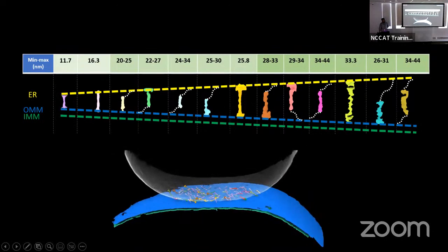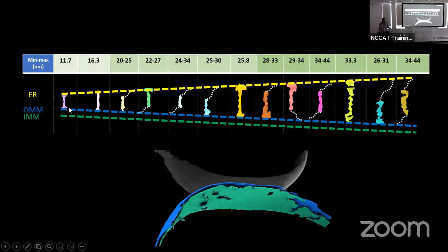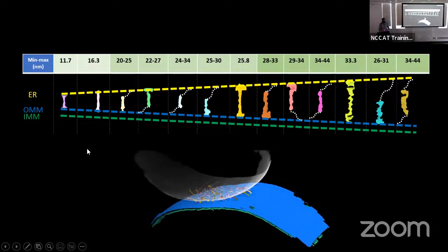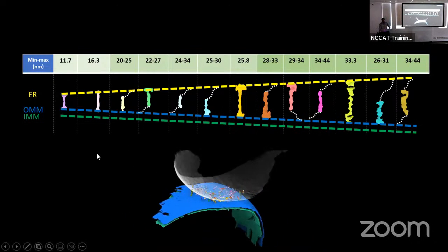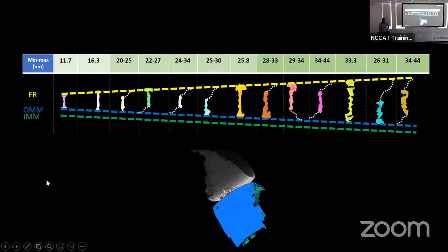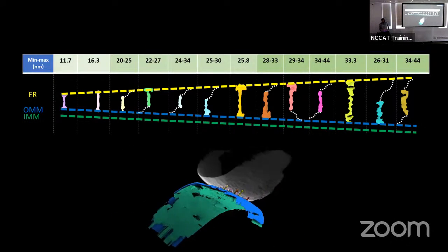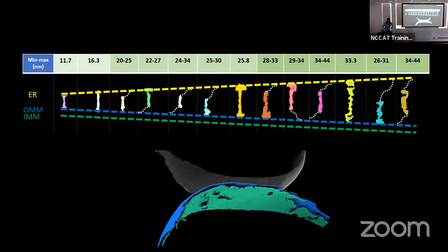And you can see that we have a large variety of sizes. So the stoichiometry should be figured out, so we have to go back to the bench and do all of that. And there's probably more than two interacting partners in each tether.